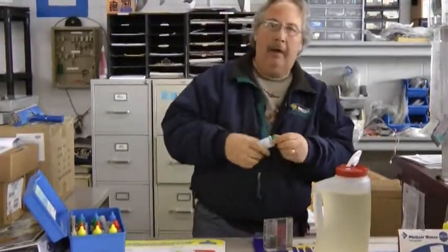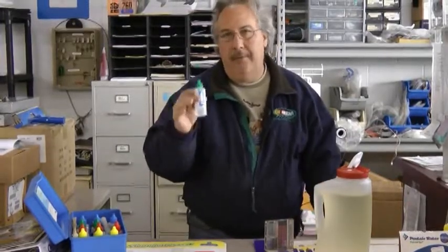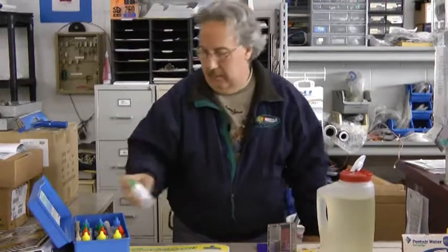If you have a high chlorine or bromine reading though, you want to use more than 2 drops, and this does not tell you that in the test kit. Again, I don't even bother counting the drops. I'll just give it a good squirt. It's just a chlorine neutralizer. You're getting rid of the chlorine and the bromine to get a truer test. Number 2, we're going to do 5 drops of number 8.